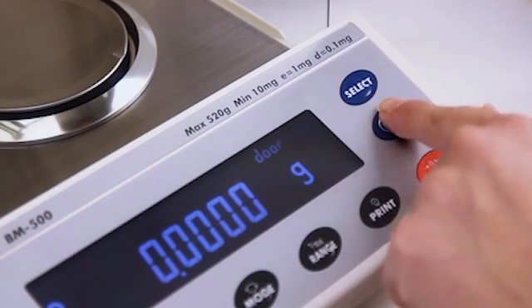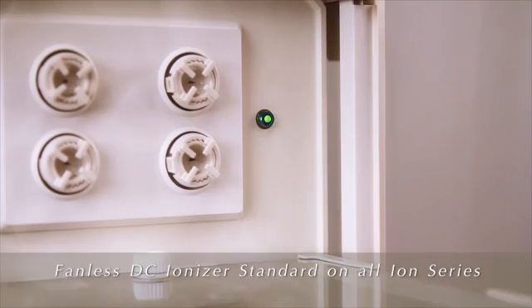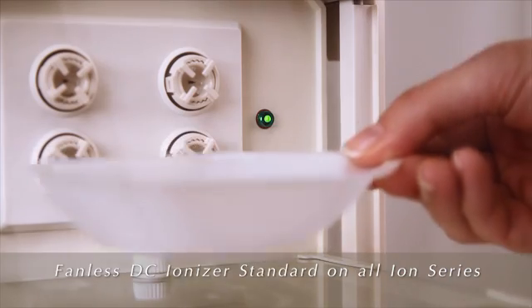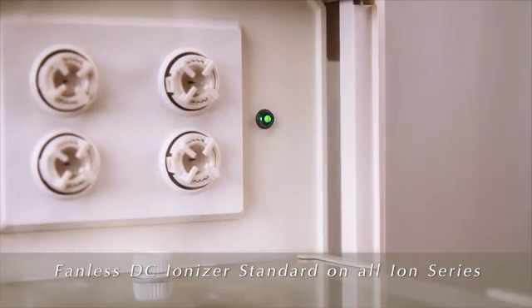To use, just press the ION button and briefly hold the sample in front of the ionizer in the neutralizing chamber to eliminate static.